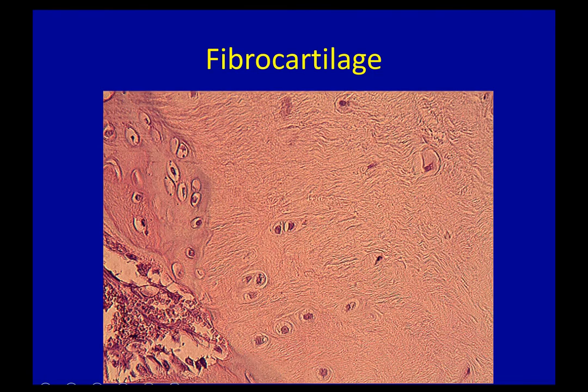So fibrocartilage. Again, what kind of tissue is it? Well, it's connective tissue. Identify the slide. Well, see all the little hairs? Look at all those hairs. This is definitely going to be fibrocartilage. I've got deviled eggs in pink jello, but I've also got all of these hairs inside the jello. Now, where would you find it?